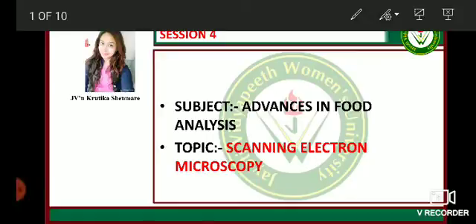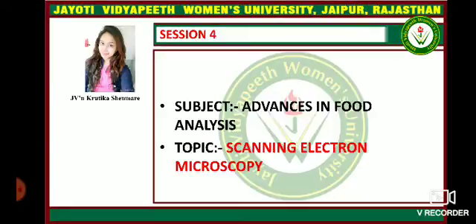Hello everyone. So this is the fourth session of the advances in food analysis, and the topic which will be continuing from the second and third session is the scanning electron microscopy.